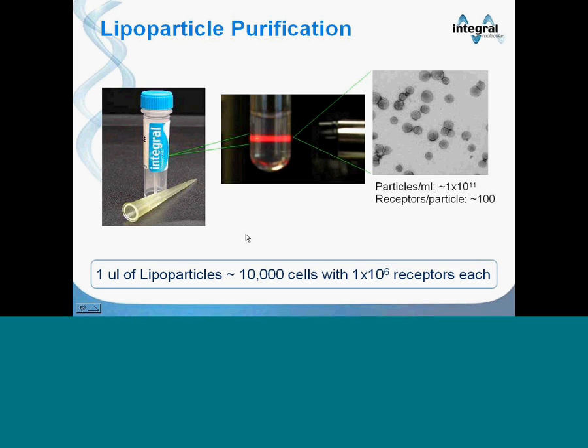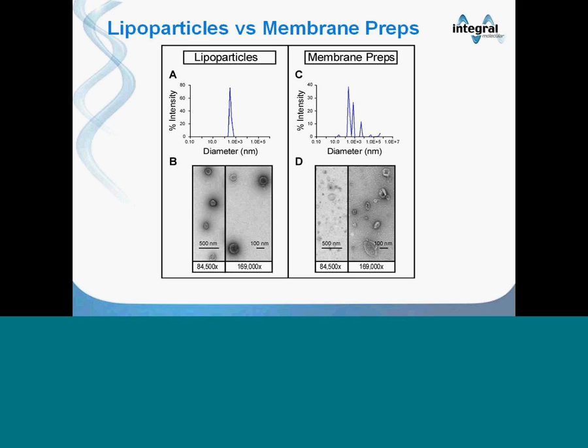Another advantage that lipoparticles have over membrane preps is that all of the receptor proteins are correctly oriented, which may not be the case for membrane preps. In addition, lipoparticles are free of any cytoplasmic contaminants.